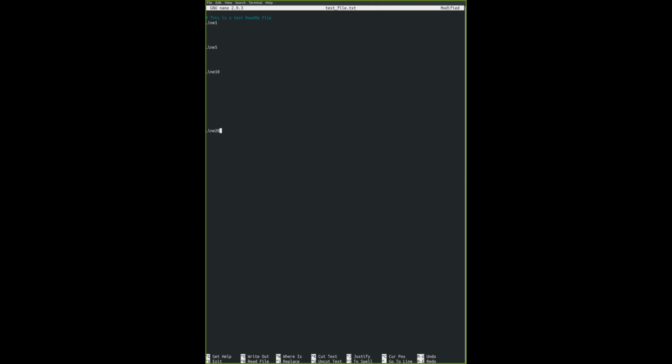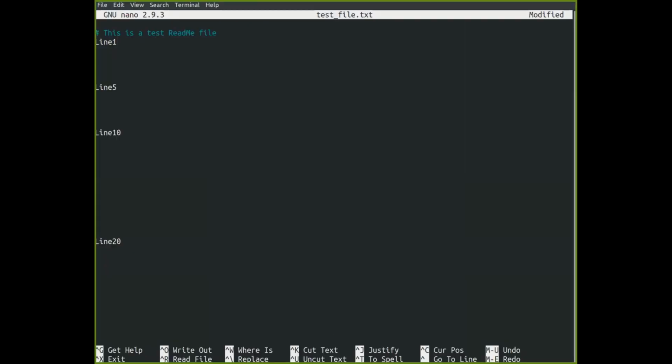I'm going to pull up a little bit so you can see the options here. There's a couple of things. One that I didn't specify is actually saving. You can press Ctrl S. Even on a Mac, I think Ctrl S works. So if not, try Command S.